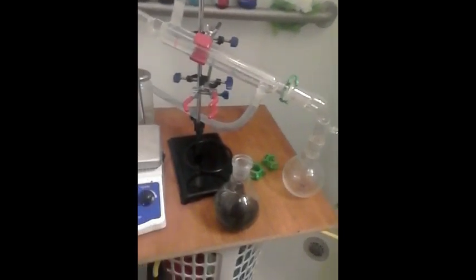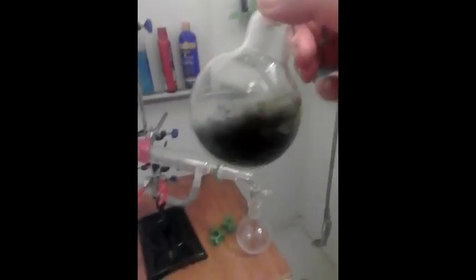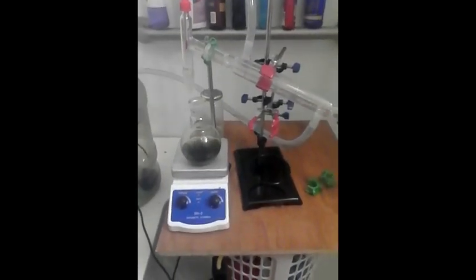Well everybody, after all that work, I'm down to this. As you can tell, it's still quite viscous and it's a little green. So I'm just going to sit here and let it cool off and let it evaporate, and it'll condense down into the oil. You can see it's greenish — it's a really deep green right now. So I'm going to call it a night and get back to it tomorrow.